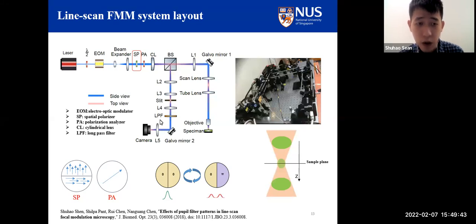And in this system, we use the sCMOS camera to capture the image. As you know, the sCMOS camera has a very high speed, so we can use it to capture images at video frame rate. This system runs at 100 frames per second.